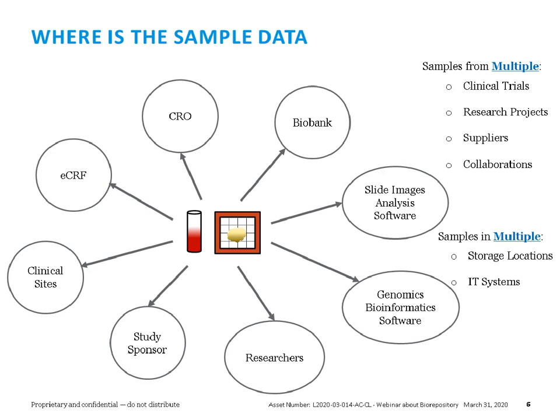And not only that, the samples themselves could be stored in multiple locations, and sometimes they could be in transit status, especially when there are shipments of samples, right? So all of this makes it more complex when it comes to biological samples.